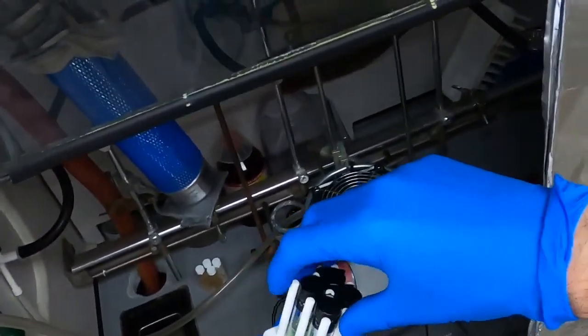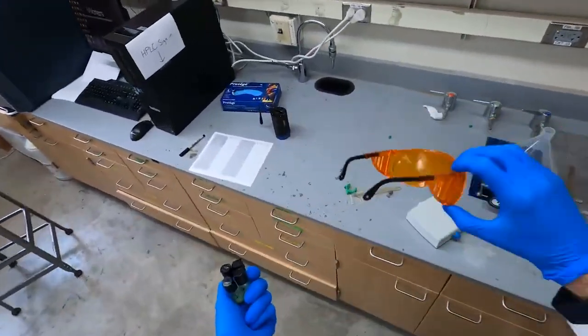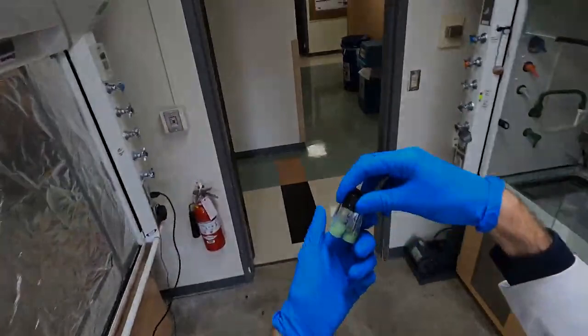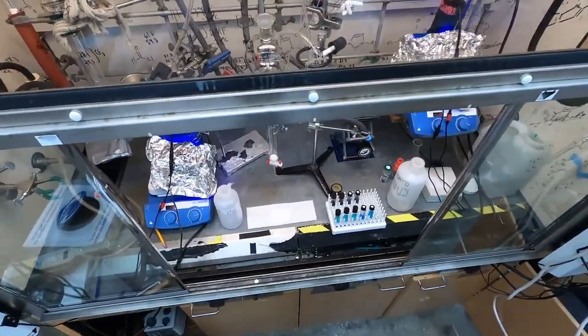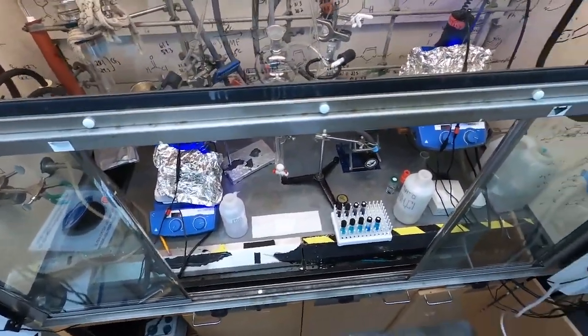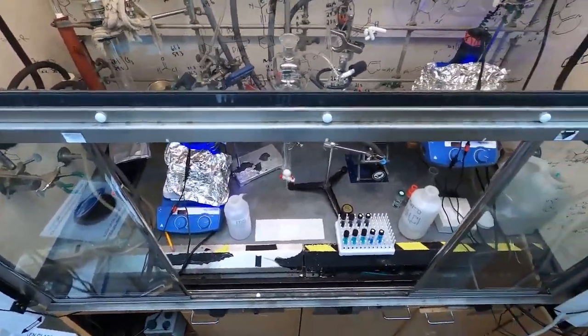Everything is looking good, and we are now ready to run the column and do the isolation on these and get that product out of there. It is now time to isolate the product from the scaled up reaction. We've removed the reaction from the scale up setup.